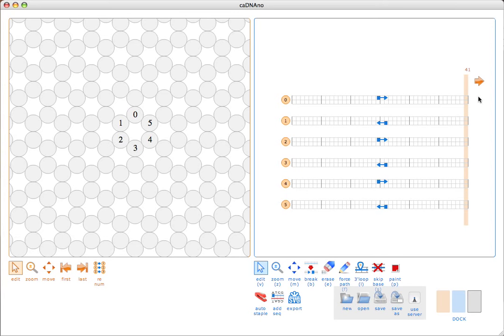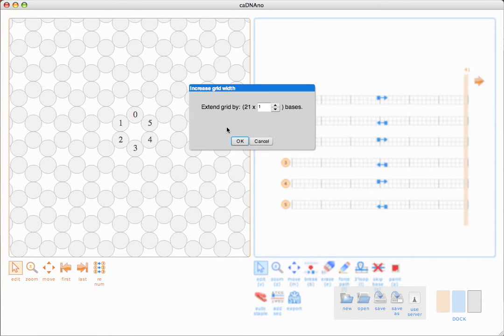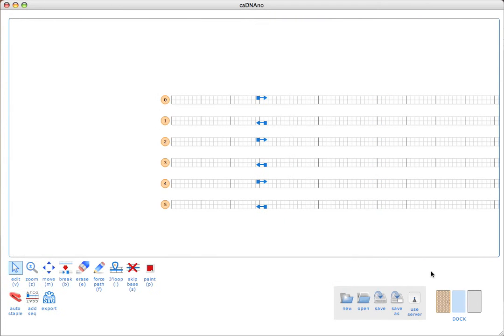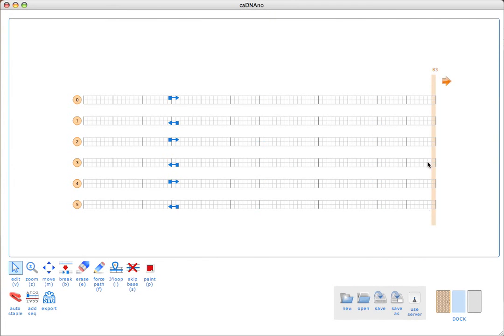This is how you expand the editing area in order to make a structure that requires more than just the default 42 base zone that we start with. The slice panel has buttons to quickly move the slice bar to the first or the last position. Let's go ahead and make this a little bit larger editing area. I get this pop-up window and I'm going to extend the grid by 42 bases, click OK.